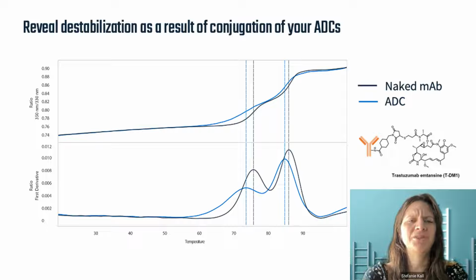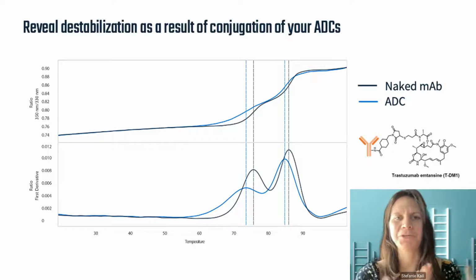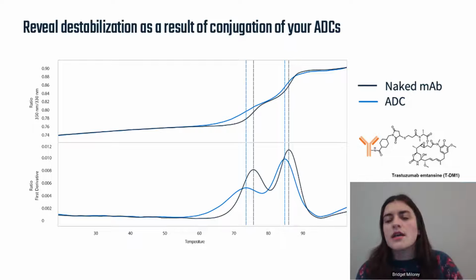Yeah, it's really neat to see how just adding that small molecule to the whole complex protein biologic really alters its behavior. Can you talk a little bit about what aspects of ADC development are going to have an impact on the final stability profile of the ADC?